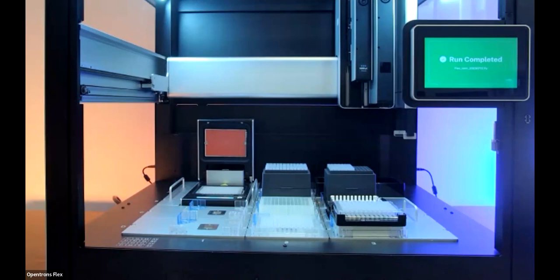Custom protocol development is the same activity, but done remotely. So via email and a few calls, they would write the script and go back and forth with you to verify that it worked. And there's obviously a price difference, with custom protocol development being a little bit cheaper.